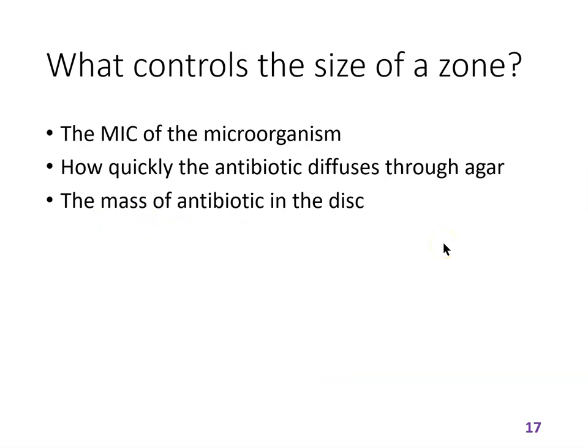you can get antibiotic discs with different masses on them. And so the antibiotic and the mass of total antibiotic on the disc, they're both printed on the disc. So for an example, you can get tetracycline. I think you can get a 10 microgram tetracycline disc and a 5 microgram tetracycline disc. And that would determine, to some extent, the size of the zone of inhibition.